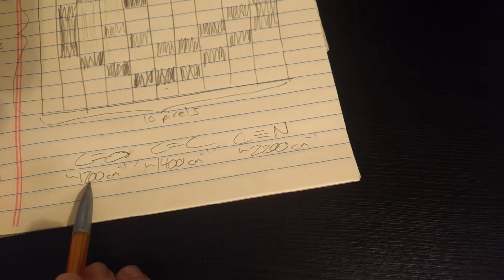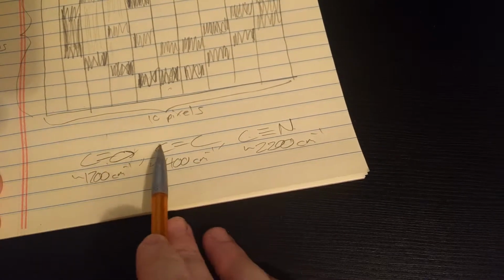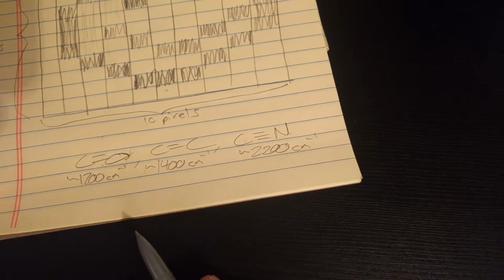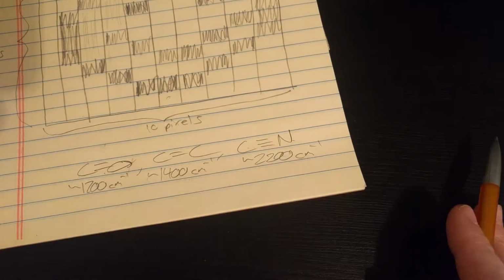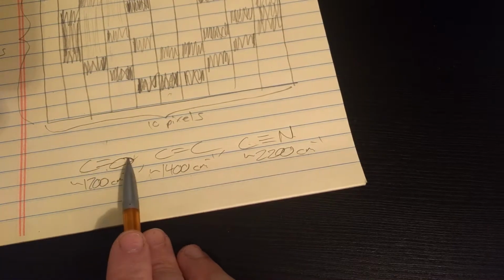Because we can make one image of the intensity of the 1700 wave number mode, we can make another image of the 1400 wave number mode, we can make another image of the 2200 wave number mode. And in that way, Raman imaging gives us a lot more information than other imaging techniques such as fluorescence might do. And since we can make a specific image for each molecule or for each bond, we say Raman imaging has chemical specificity.